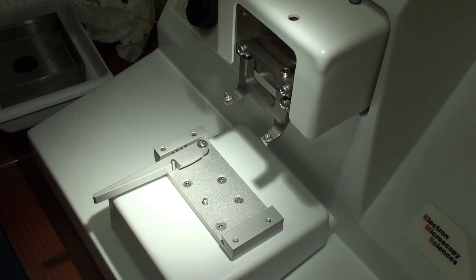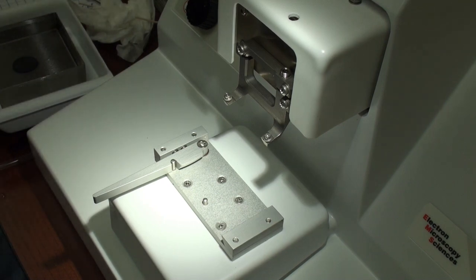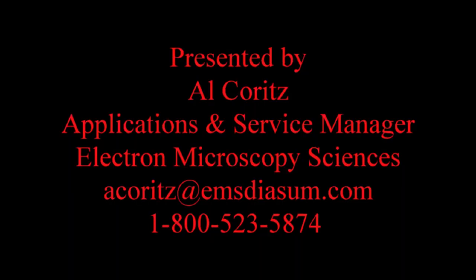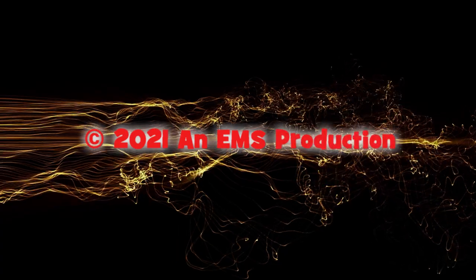But in this case, we've finished the demonstration, so we'll shut it down. And that concludes our setup and operational demonstration of the Electro Microscopy Sciences 7000-SMZ-2 vibrating microtome. Thank you for your attention.